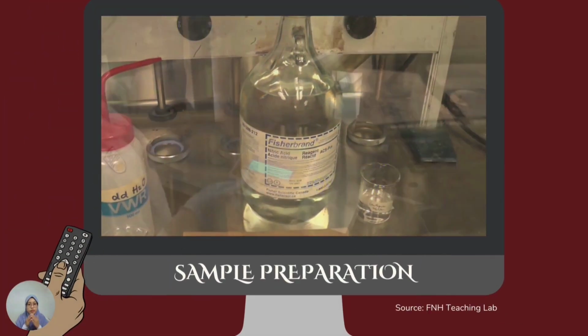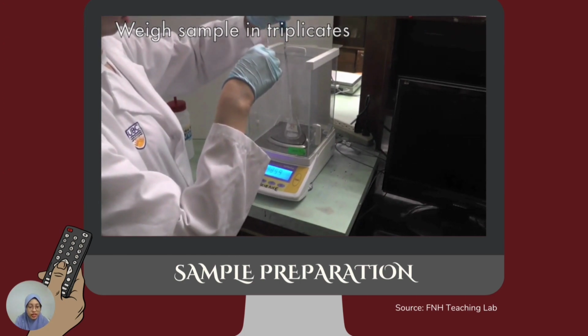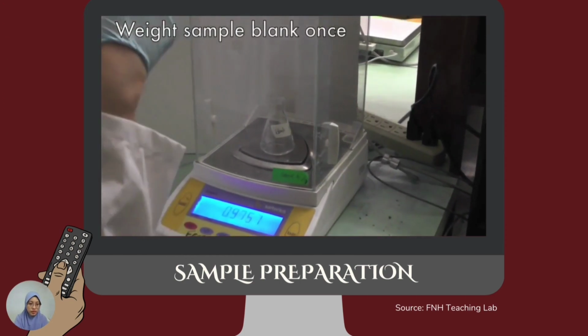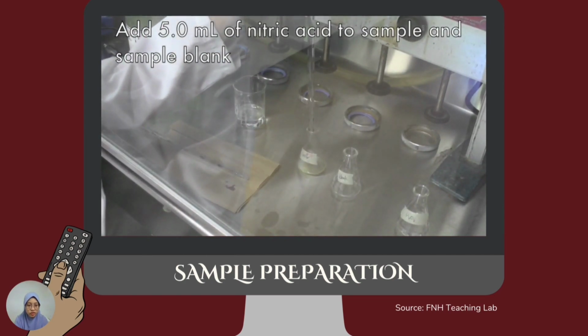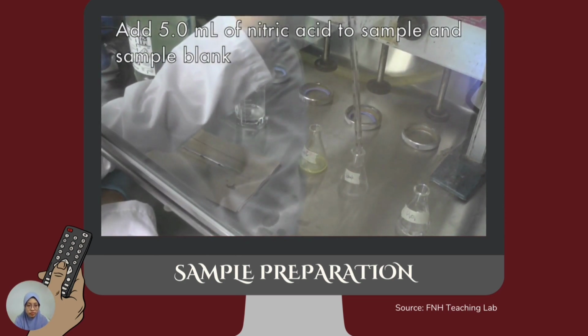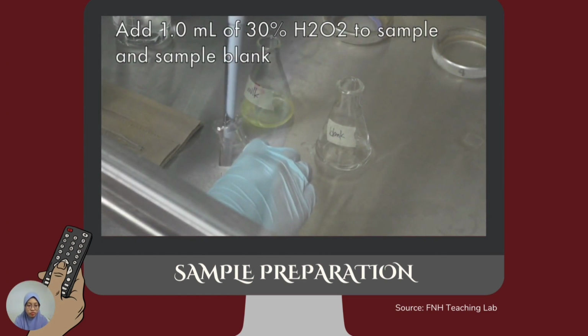Next, you want to know how to prepare the sample. Let's begin with the sample. Weigh 1.0 gram of milk into a 50 milliliter Erlenmeyer flask. Perform in triplicates. For the sample blank, weigh 1.0 gram of DD water instead. Do this only once. Inside the fume hood, add 5.0 milliliters of concentrated nitric acid and 1.0 milliliter of 30% hydrogen peroxide to each sample and sample blank. Please note that the fumes created by the reaction will be very toxic.